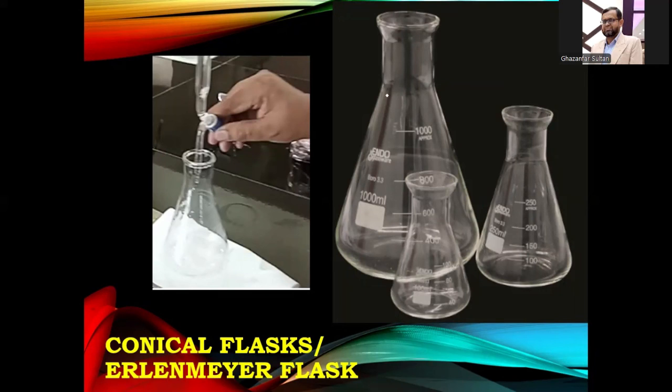In titration, we use it because it has a narrow mouth. So spilling of any content from the conical flask is not easy, and we can transfer our aliquot from the burette easily. So we can handle it very easily.